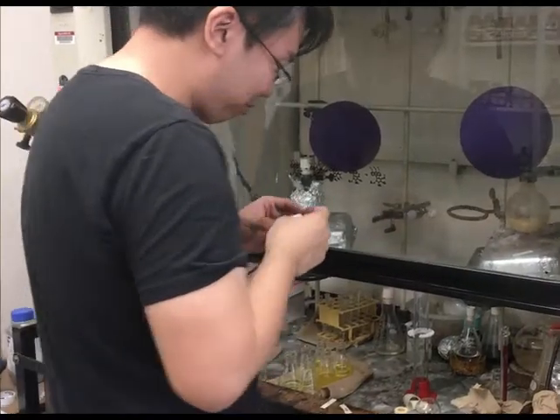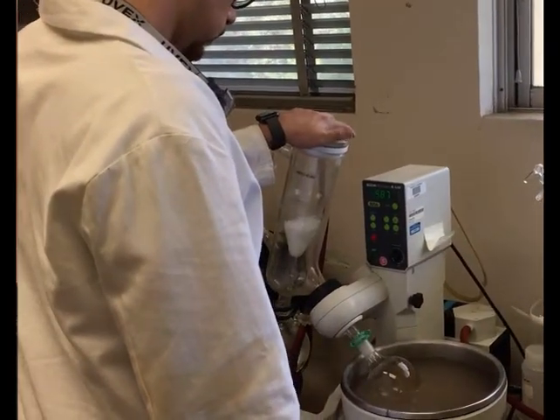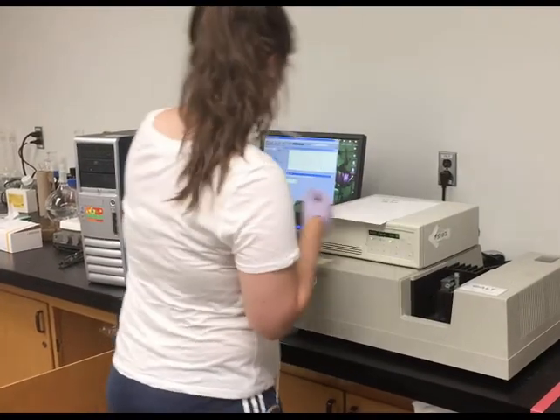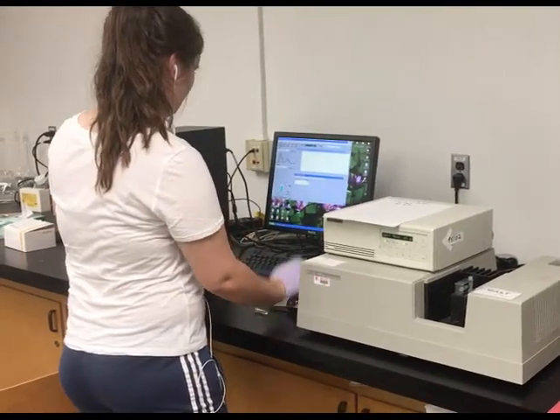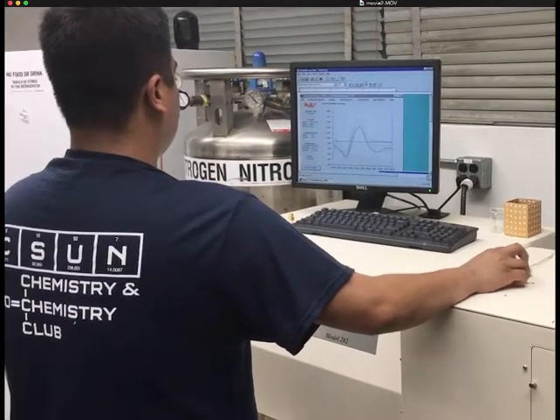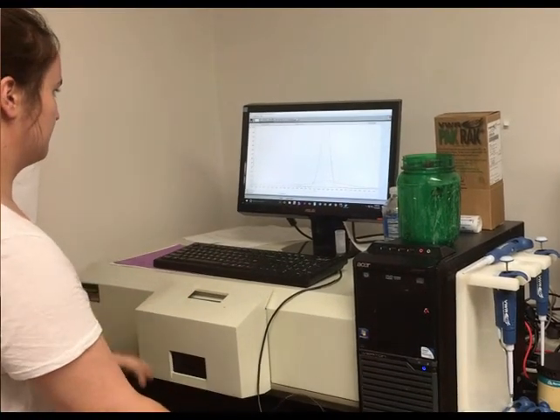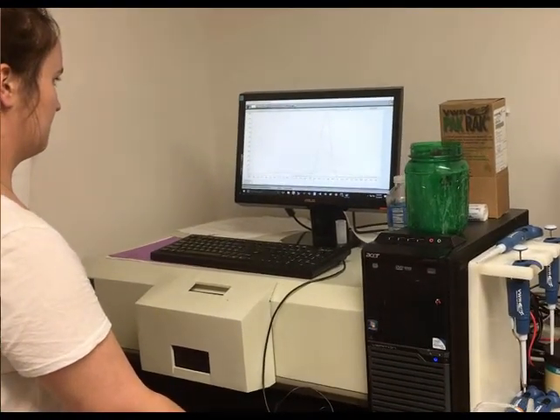I'd like to briefly describe to you today our research program here at Cal State Northridge involving undergraduate and master's level students. Students in our laboratory use the techniques of organic synthesis and molecular spectroscopy, specifically fluorescence spectroscopy, ultraviolet spectroscopy, and circular dichroism, to investigate the binding of small organic molecules to duplex nucleic acids, specifically in our case, DNA.